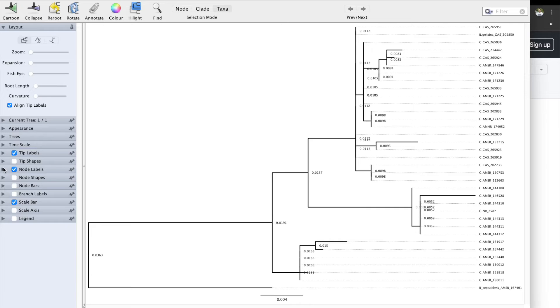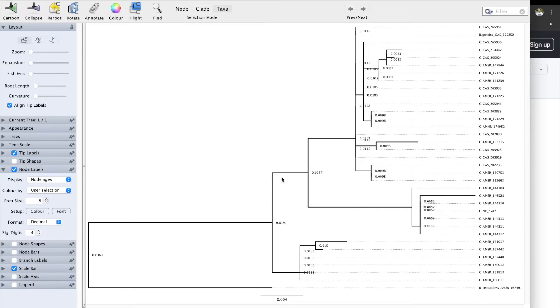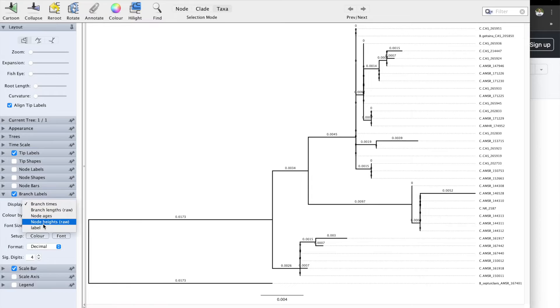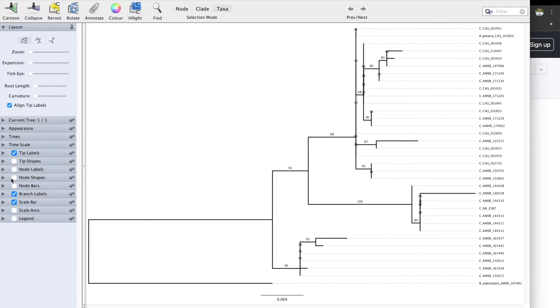When you click on node labels, as you can see, it doesn't give you the bootstrap values you're used to seeing, like 80, 70, 85, or 100 — it shows a weird number. To change that, click on the display and change it to label. Now it gives you the numbers you are familiar with. Let's repeat the process for branch labels as well. It's up to you whether you want to use node labels or branch labels — I like to use branch labels a little bit more. For example, 92 stands for right here.